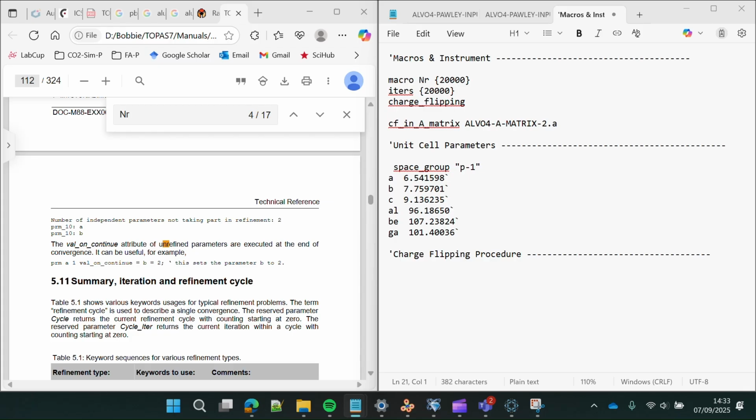So I'll run through what we're going to use on this run, and then I'll also include some other ones that I've seen that you could use and play about with.